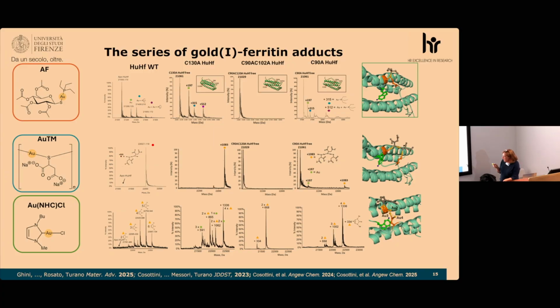And what we saw is that if we stay with these 2 compounds, we have binding only to the 2 solvent exposed cysteines, while in the other case, if we use a quite large excess of these compounds, we can have also partial metallation of the cysteine that is inside. Okay, so we had an idea, but the problem of this approach is that you disassemble the cage.